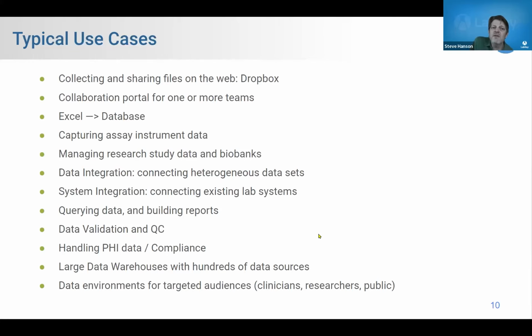Well, you get some advantages. When you move from Excel to a database, you're moving from a pretty wild, unstructured data world into a more controlled, structured data world. And there are some disadvantages to that. You can't just do whatever you want inside a database. You've got things like data types. You can't put a text value inside of an integer field. So you've got some restrictions there.